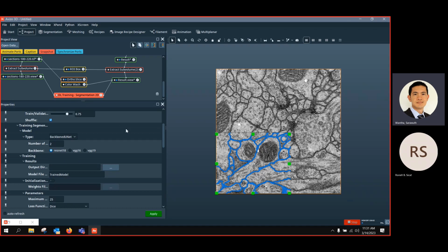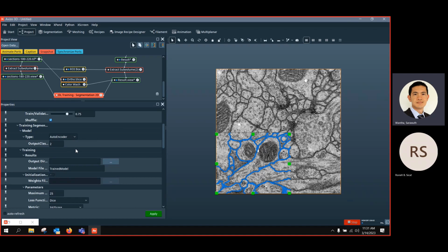But as we discussed with Yin and Abdel, if you use another model, for example an autoencoder from somewhere else, in the next step when we do prediction it's going to conflict with the model, because the prediction step is going to use the model from the U-Net anyway, and we don't have another model provided for prediction. So just keep in mind that it could somehow interfere with your training. So by default, just use the backbone U-Net.